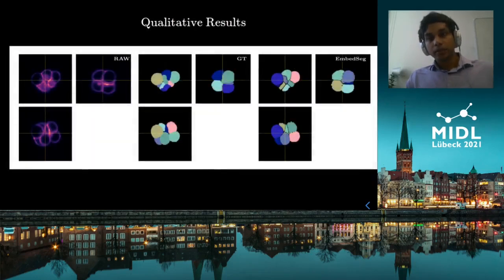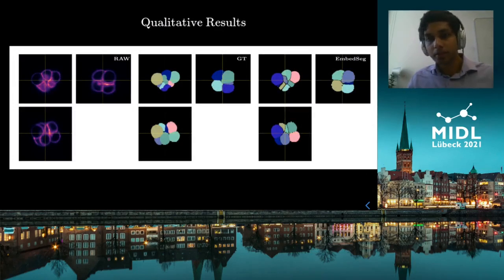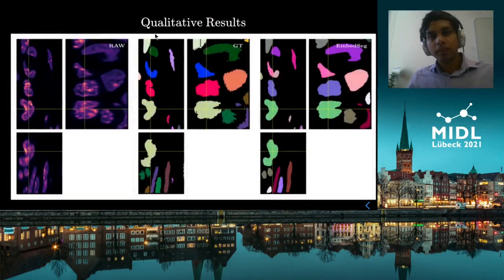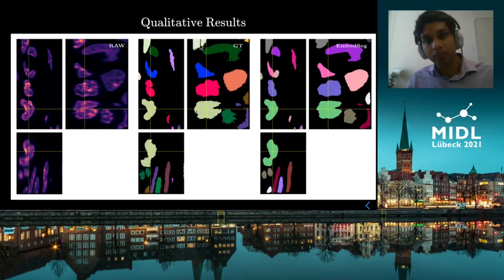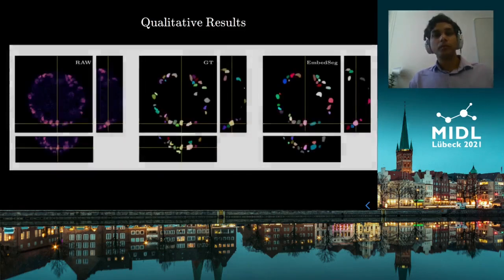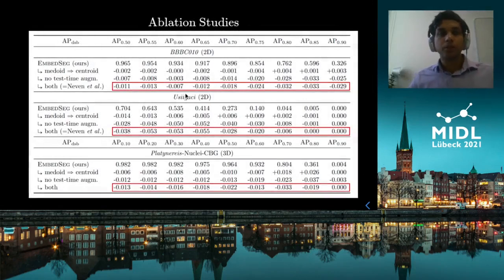Looking at qualitative results, we see the XY, Z, and ZX slices of the raw image, the ground truth image, and the EmbedSeg predictions. Sometimes the ground truth annotations have some mistakes — for example, one slice was not annotated — but EmbedSeg predictions are quite robust and provide a good representation of the underlying shape. We also performed ablation studies showing that removing both of our proposed modifications leads to a drop in performance across three different datasets.